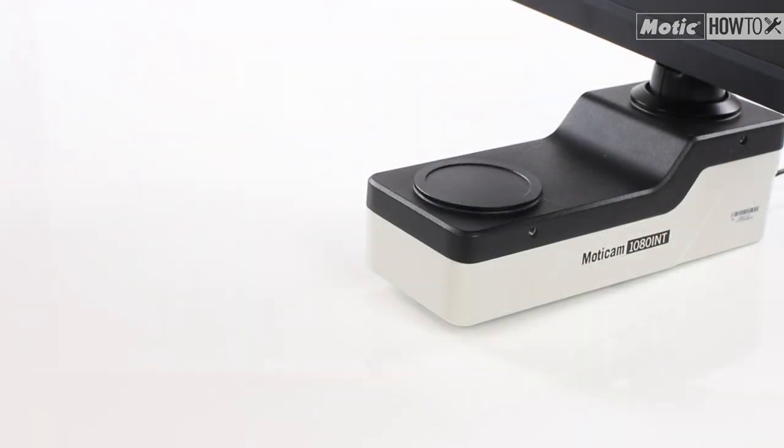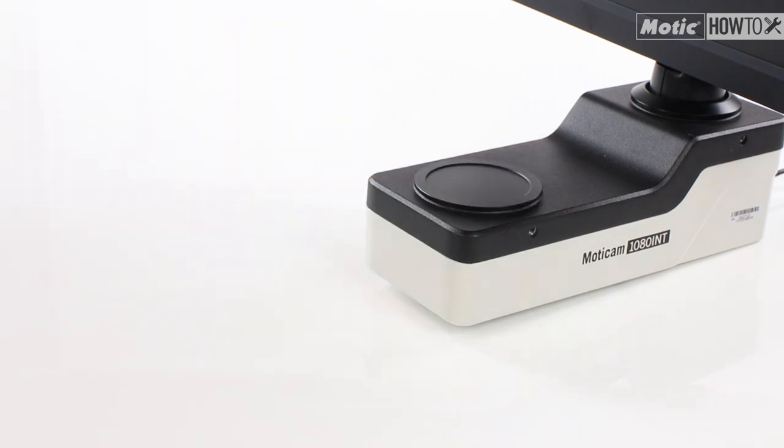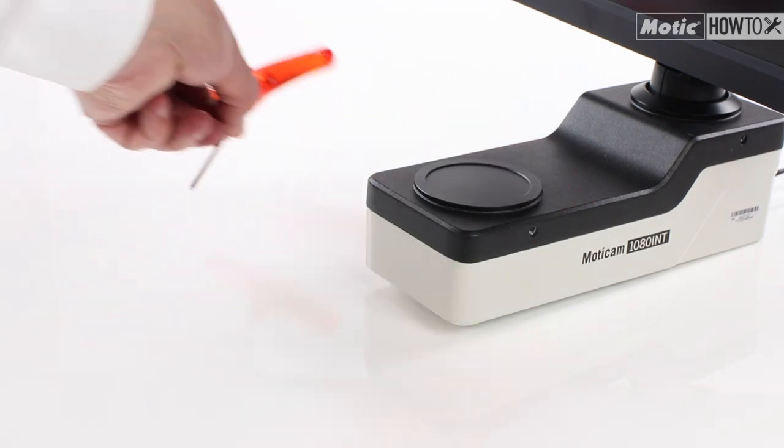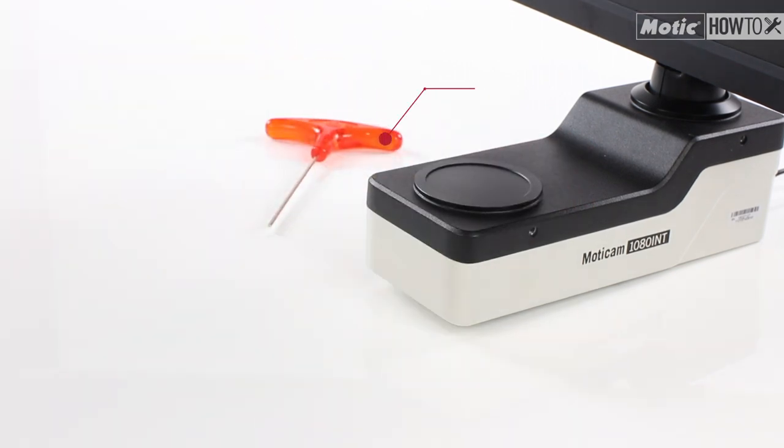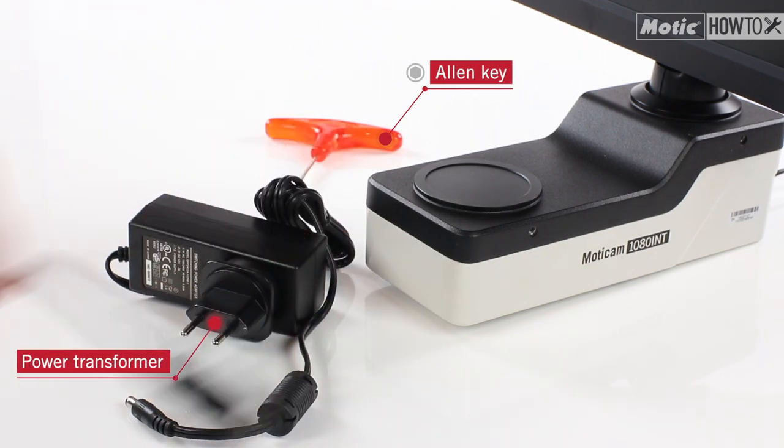These are the components supplied with the Moticam 1080 INT camera: an Allen key, a power transformer, and an HDMI cable.